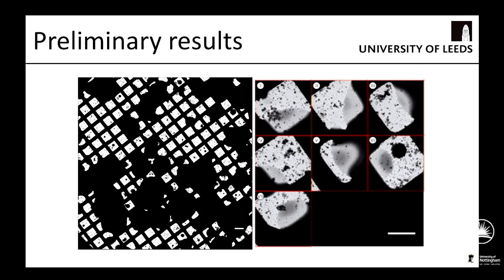What do the grids look like? Well, I guess look away now to some extent, because they certainly don't look as pretty as some of the grids we've seen already today. And you get a lot of these very thick ice layers here, but you get these little islands of hope and these little regions of ice that you can go for.